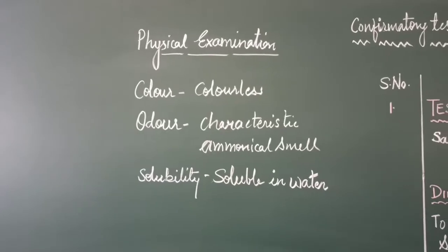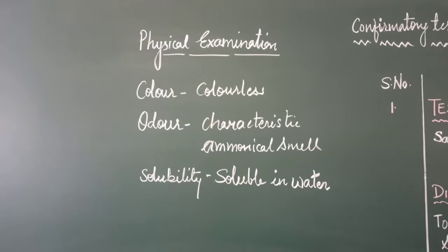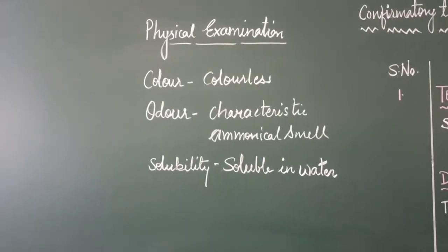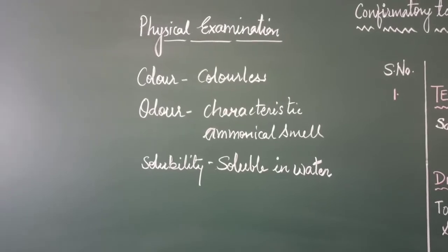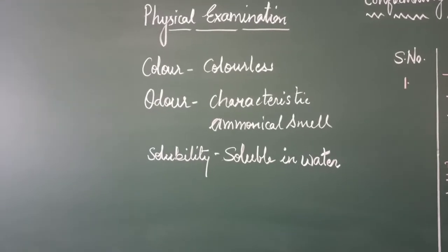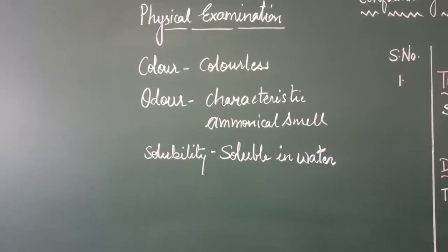Hello everyone, and now we are going to start with the salt analysis. So we have got a white salt. I'll show you when we will start performing the analysis. After looking at the salt, I have noticed some things in the physical examination. On the basis of physical examination, these are the points which I have noticed.